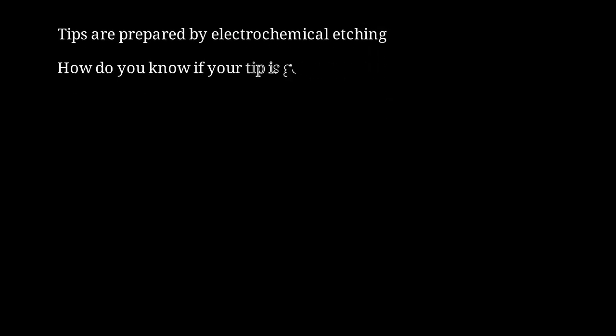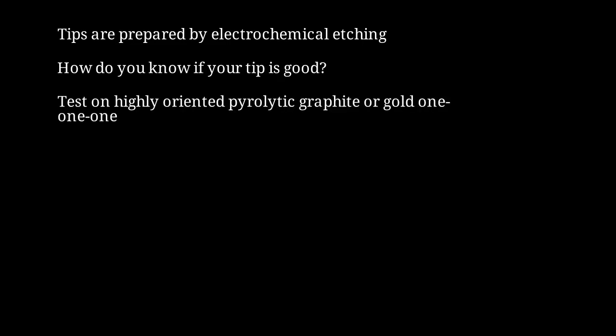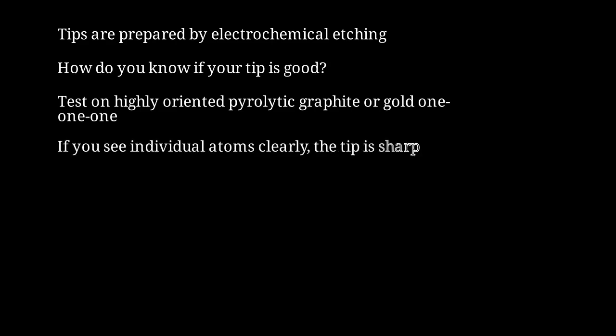Here's a key question. How do you know if your tip is good enough? You test it by imaging a reference surface with known atomic structure. Highly oriented pyrolytic graphite, or HOPG, is often used as a test surface because it's easy to prepare and has a well-defined hexagonal lattice. Gold 111 surfaces are also common standards. If you can resolve individual atoms with good contrast and without double-tip artifacts, your tip is sufficiently sharp. If not, you may need to recondition or replace the tip.